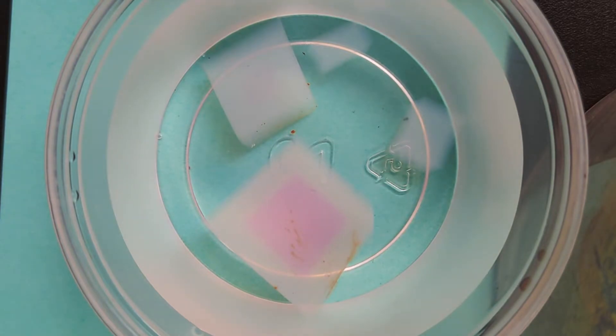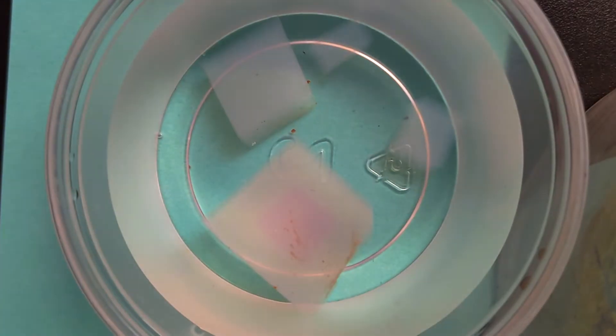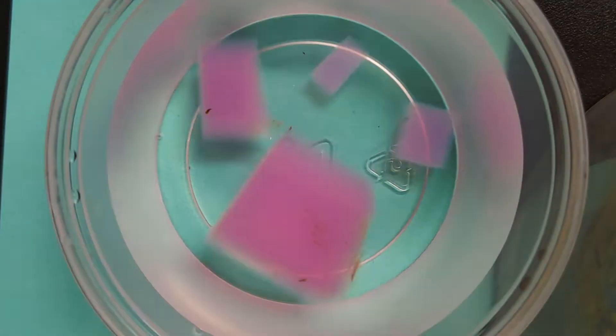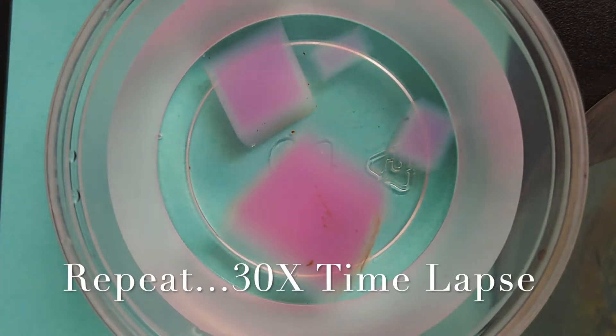The cells are built of agarose gel and then infused with sodium hydroxide, which is a strong base, and phenolphthalein, which is an indicator of strong base — it turns pink in the presence of a base. We drop the cells in vinegar, acetic acid, and as the acid moves from high to low concentration and enters the cell, it starts to infuse the cell with acid, donating hydrogen protons to the hydroxyl groups of the base, neutralizing the base, and the phenolphthalein goes clear.